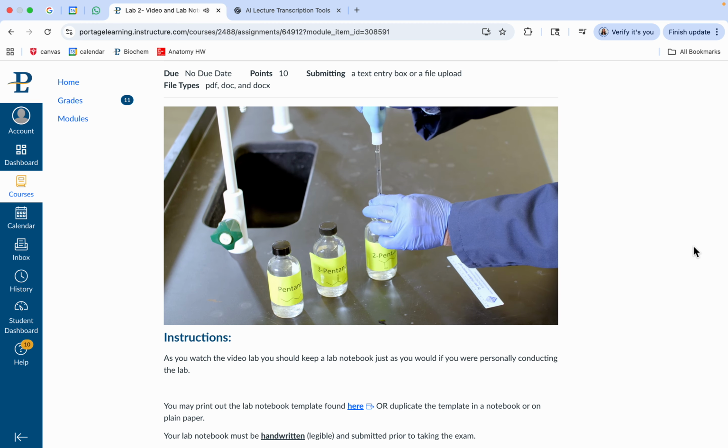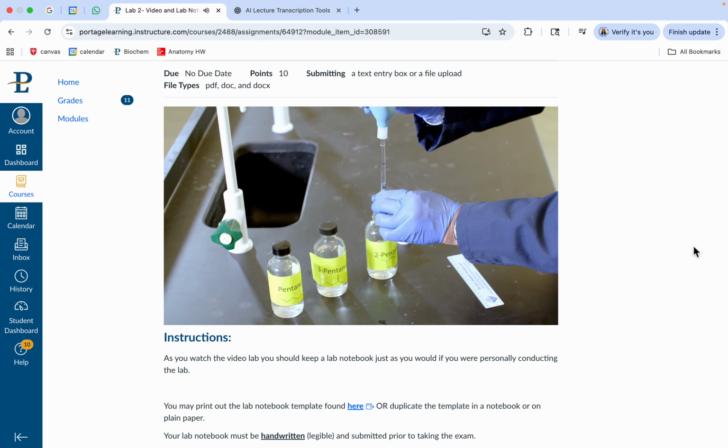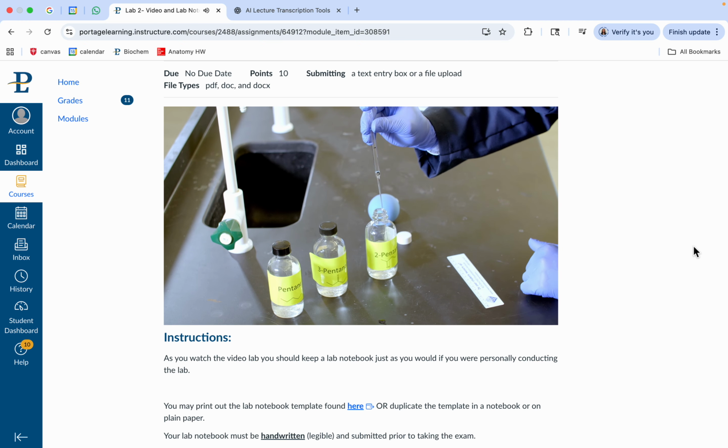Stop. All right, so once again, qualitatively, just looking at it, you know that pentanone is a little bit slower. All right, so I have it now in position, so I'll say start. Stop. And we get one more. So I have the third one now in position, so I'll say start. And stop.